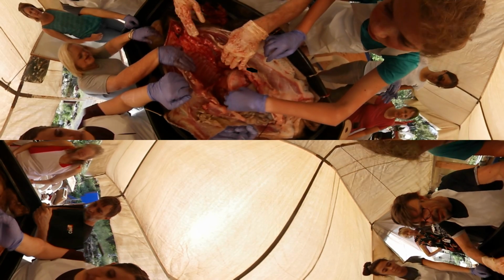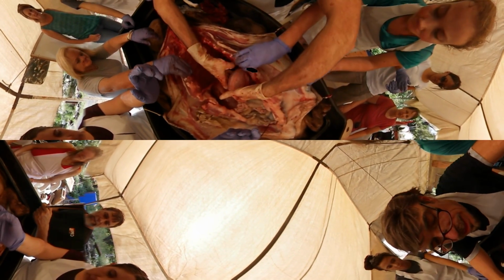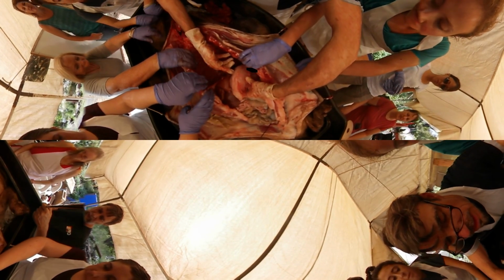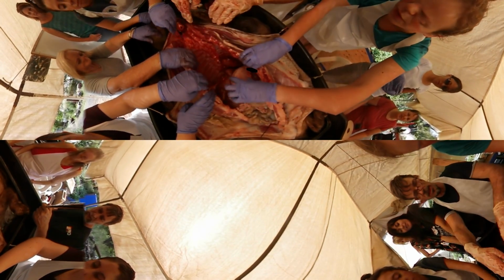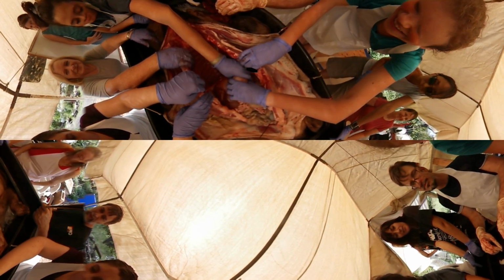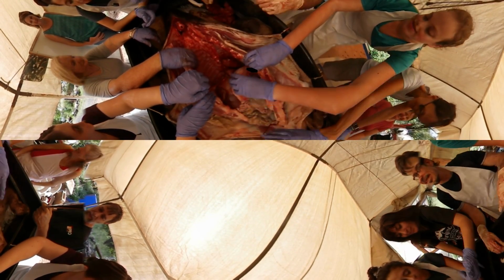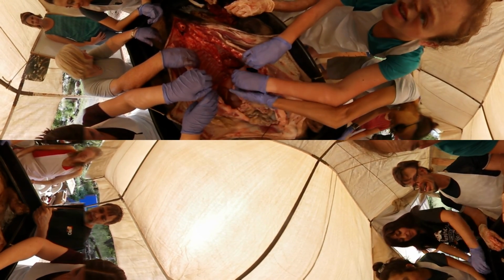Okay, so here we are. We've done the stomach. Look how big this stomach is. A lot of it is air. You can feel it's kind of like a balloon. Can you push it without popping it? Oh, it's strong. It's not going to pop. Is there some food in there, or what's in there? Likely. I have opened it for teaching purposes. We will not do that until you're getting ready to put it in the trash bag.